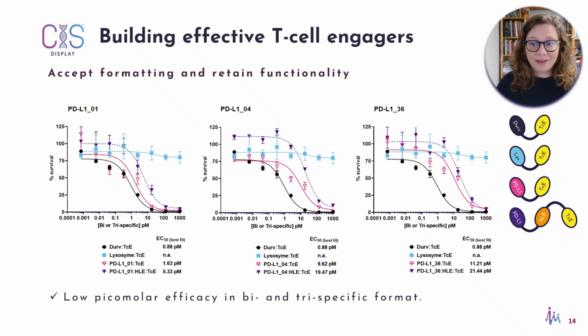Something that is very likely to happen in your project is that you are not intending to use the VHH as a monomer as its final application. Probably you are looking to do ADCs, CAR-Ts, bispecific formatting, or whatever additional molecule. So it is important to also understand: do these VHHs accept formatting? We did do that testing.